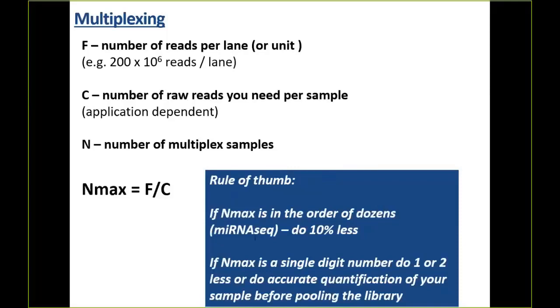If I'm absolutely, positively depending on a flow cell to perform at its spec of generating 50 million reads, it'll generate 40 million. It's just Murphy's Law. So to guard against this, we basically will just knock it down.